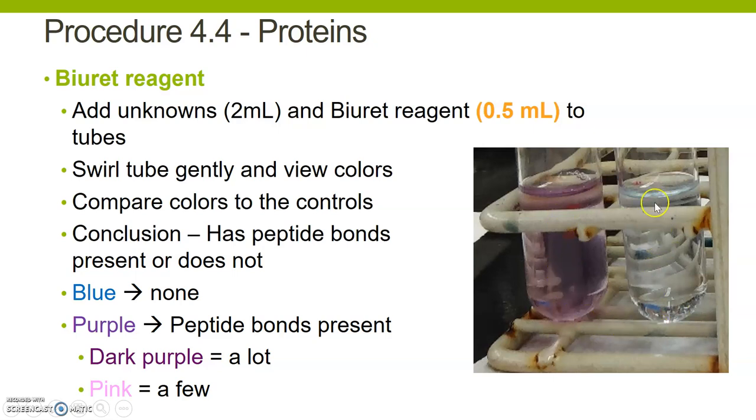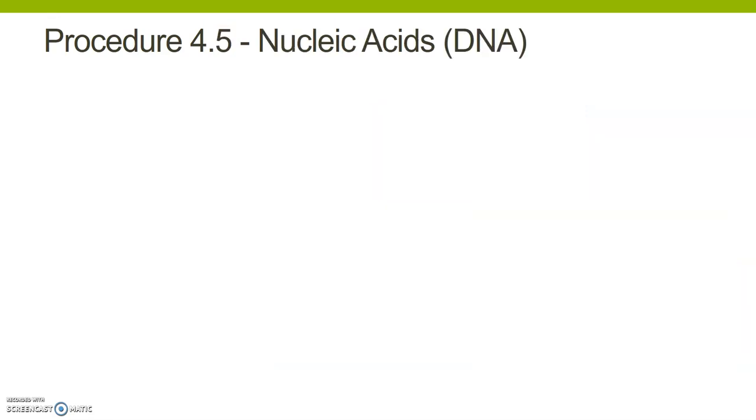Then over here, nothing happened. All right, it's kind of a blue color, right? You have a light bluish color, which is going to mean there's no peptide bonds, there's no proteins in this solution. So by comparing to these two, you can determine not just if peptide bonds are present, but even how many peptide bonds are present, right? Is this a lot of protein or a little bit of protein?